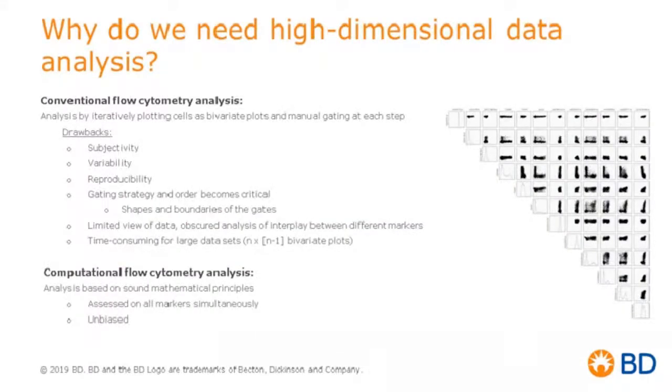Another challenge that comes with expanding our panel from a 12-color to an 18-color is the complexity of the analysis of the data that we are going to generate. The more parameters we have, the more exponentially increases the complexity and the combinatorial possibilities of the markers' expression that we're looking at.